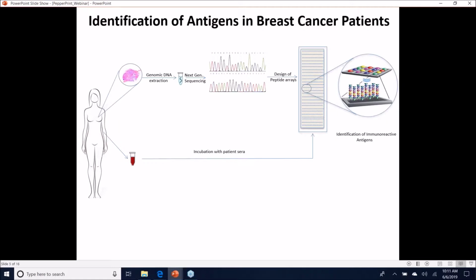The reason for high-depth sequencing is that you can imagine tumor cells are mixed with normal cells, as well as fibroblasts or immune cells, as well as endothelial cells from blood vessels. So if you really want to identify mutations, you should sequence at high depth so that even if a few tumor cells are mixed in the normal-rich region, you'll still find it. So we did high-depth sequencing.